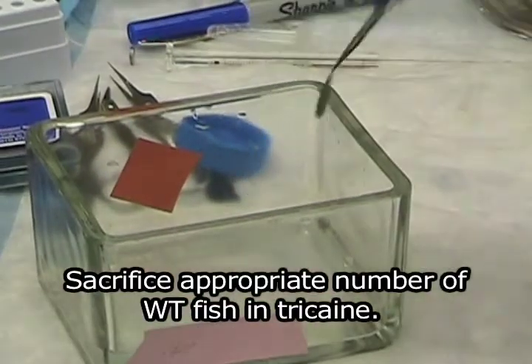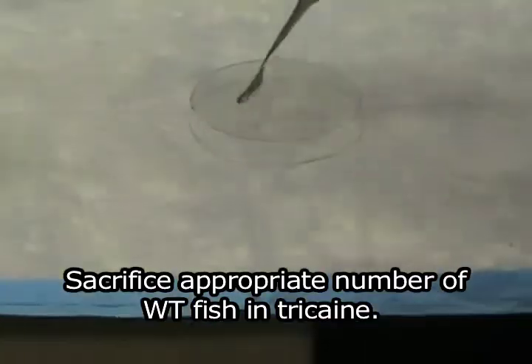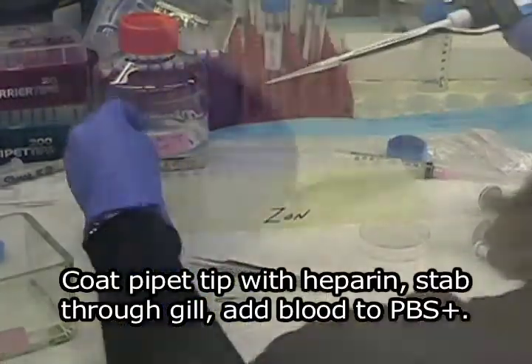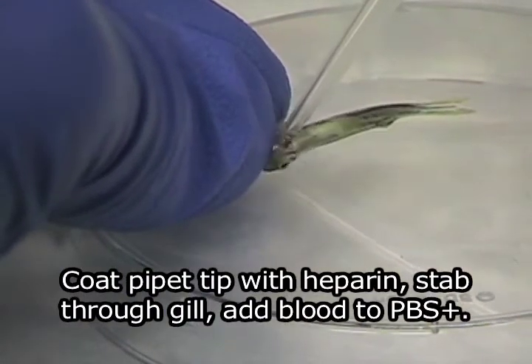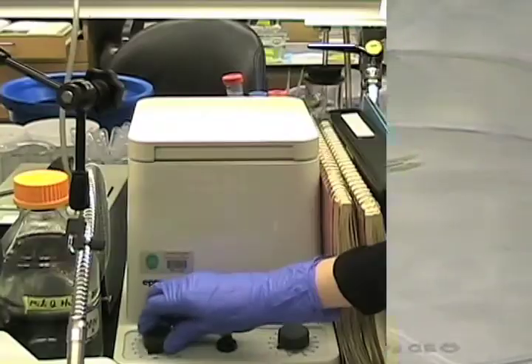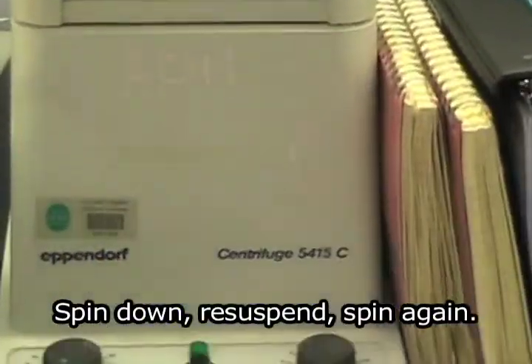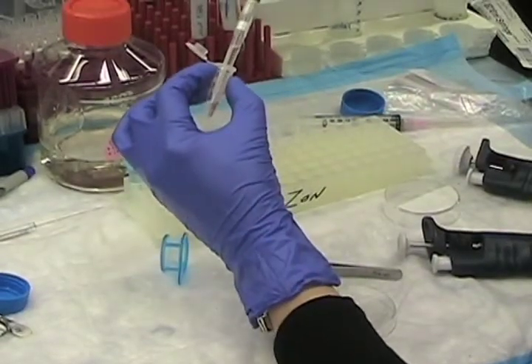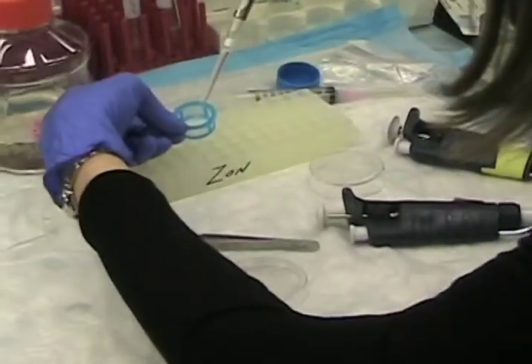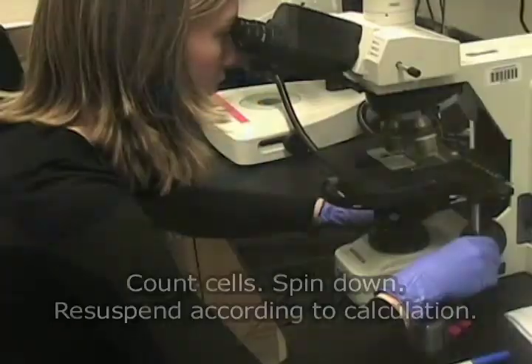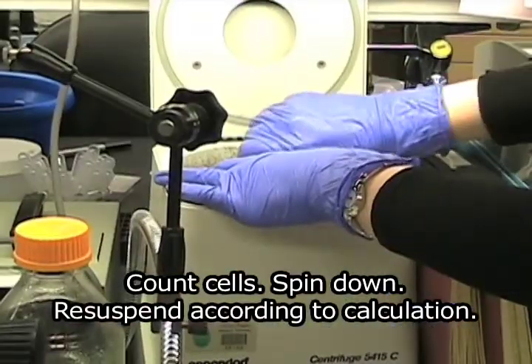Sacrifice fish in tricaine. Coat pipette tip with heparin. Stab through gill with pipette tip. Add blood to PBS solution. Spin down. Resuspend. Spin down again. Filter through 40 micron filter. Count cells as with the whole kidney marrow.